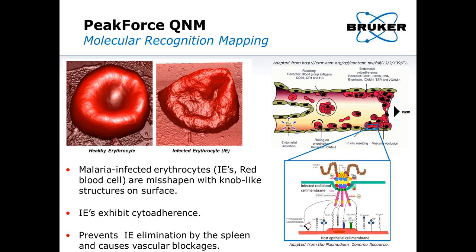So I want to now show you, or you may have this question, where AFM will work, or in what kind of environment it will work. Initially, both STM and AFM were done in vacuum. Not until we made AFM and STM work in air and in liquid was its use more widespread, and it's more popular. So anyone can use it in different environments.